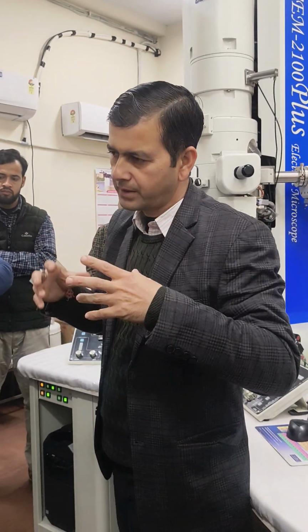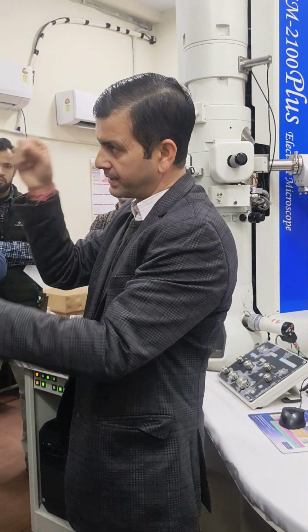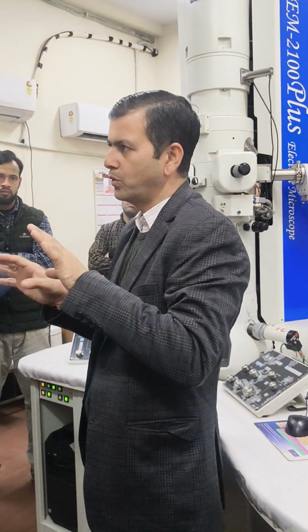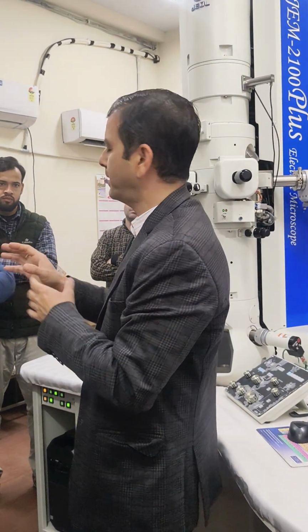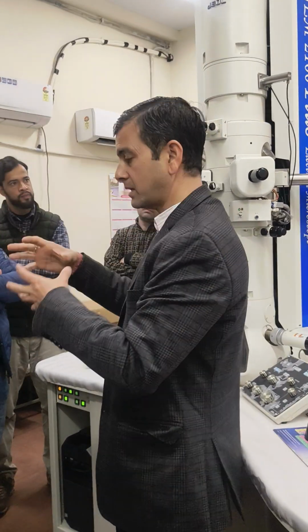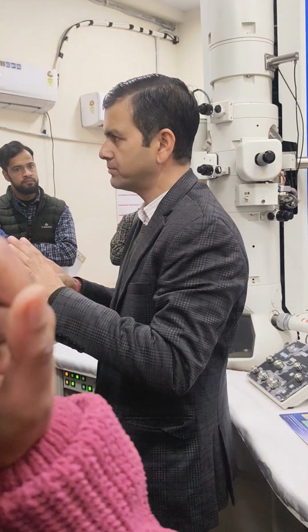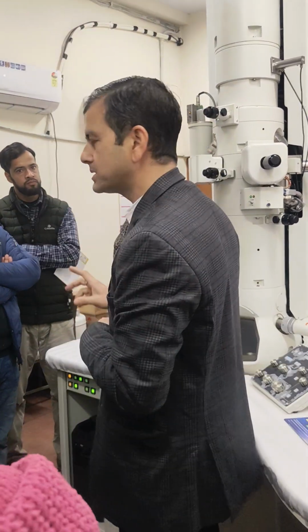Suppose you have a very strong sample, some material science sample, some semiconductor. You need more penetration. But if you have a biological sample, we need not put it under stress, so many times we make a broad beam. Not without an aperture, because that gives bulk illumination and will burn the sample. So it is a live thing we need to do. This is the condenser aperture.